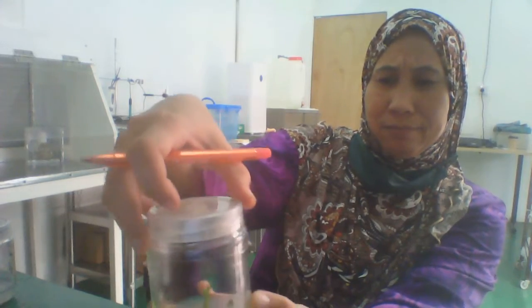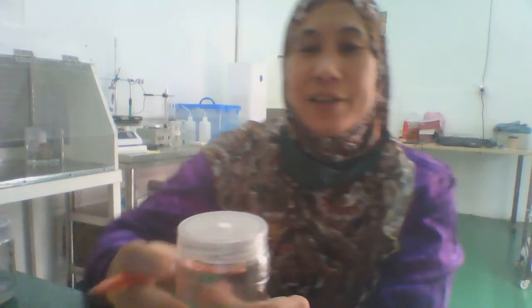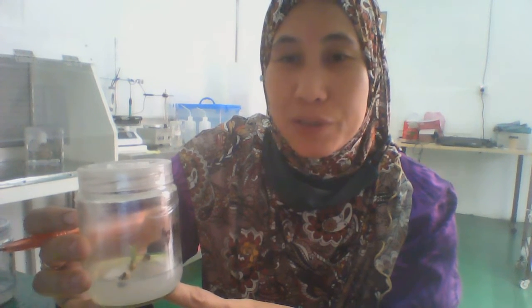Okay, so these 3 of them, and then what I did yesterday also is this one, this is caladium, because previously I put this caladium in MS plus 1 BAP, and I found that the growth is really slow, so I changed and I subcultured it into MS plus 5 BAP, and hopefully the growth will be better, because I saw some different culture that I did in MS plus 5 BAP for caladium.